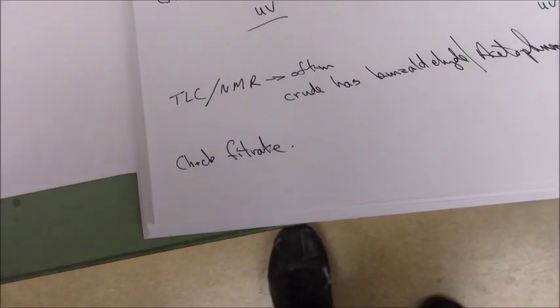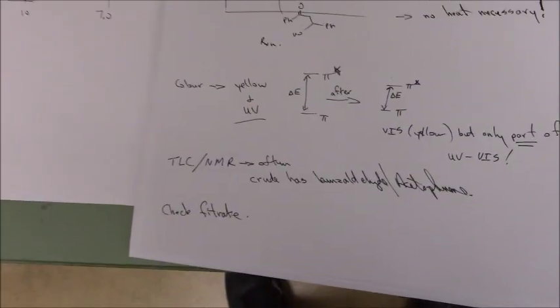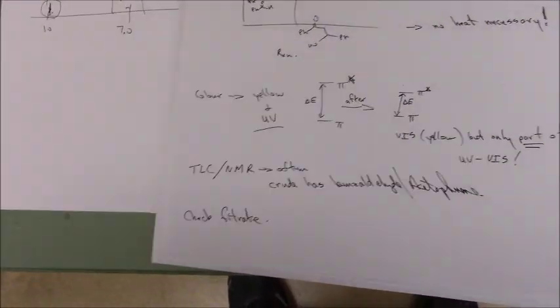Now, the other thing we can say is there does not appear to be any significant decomposition in this reaction. There's no browning, so it looks like the yield is pretty good. So that's all we got.